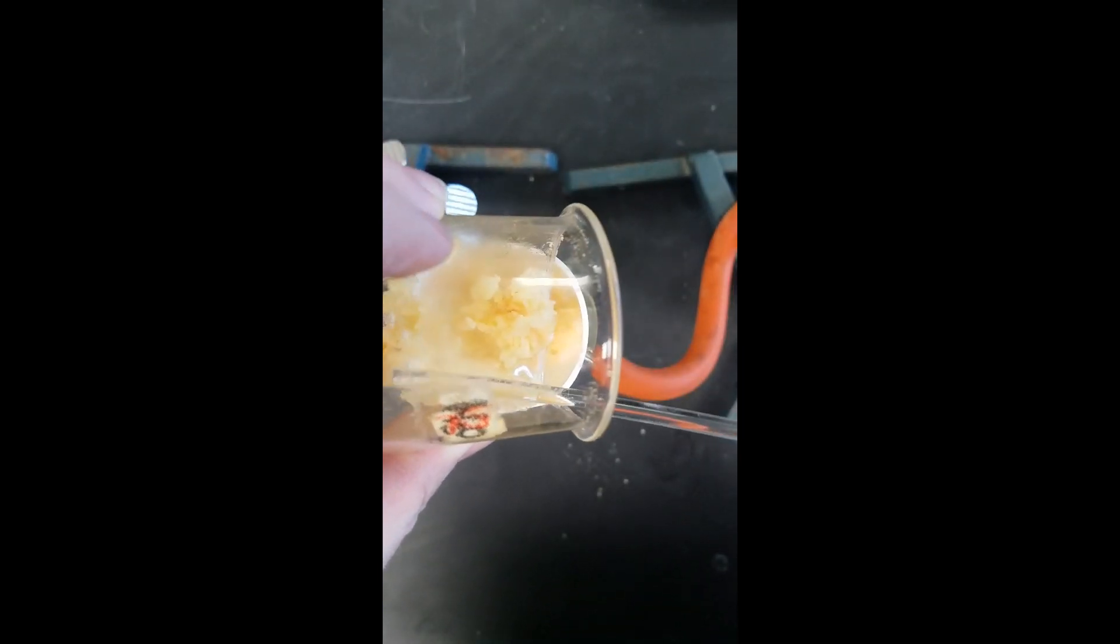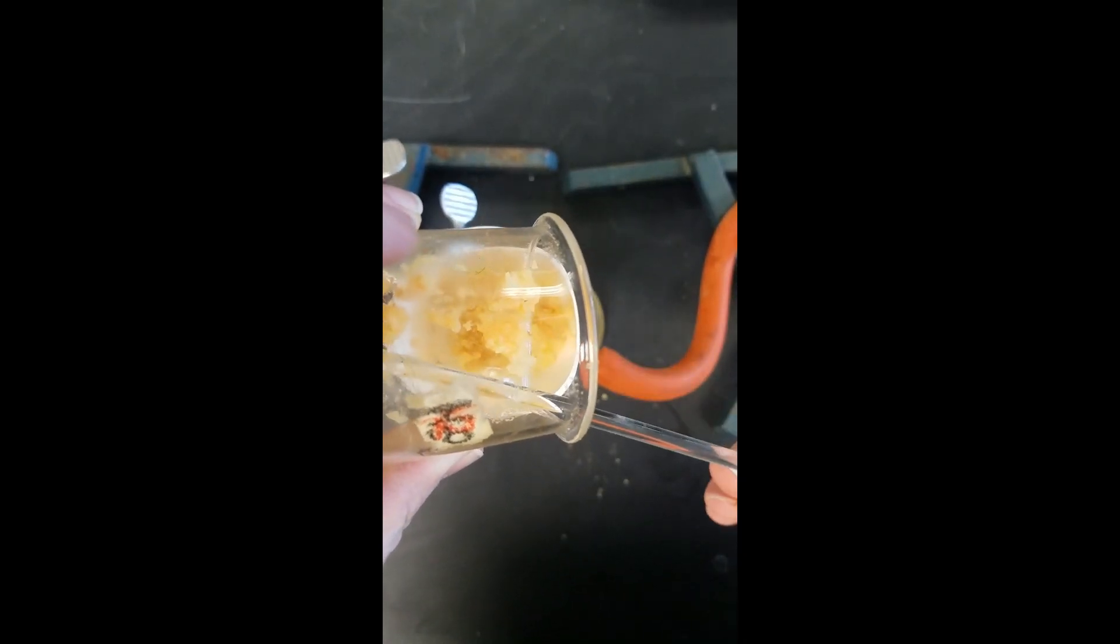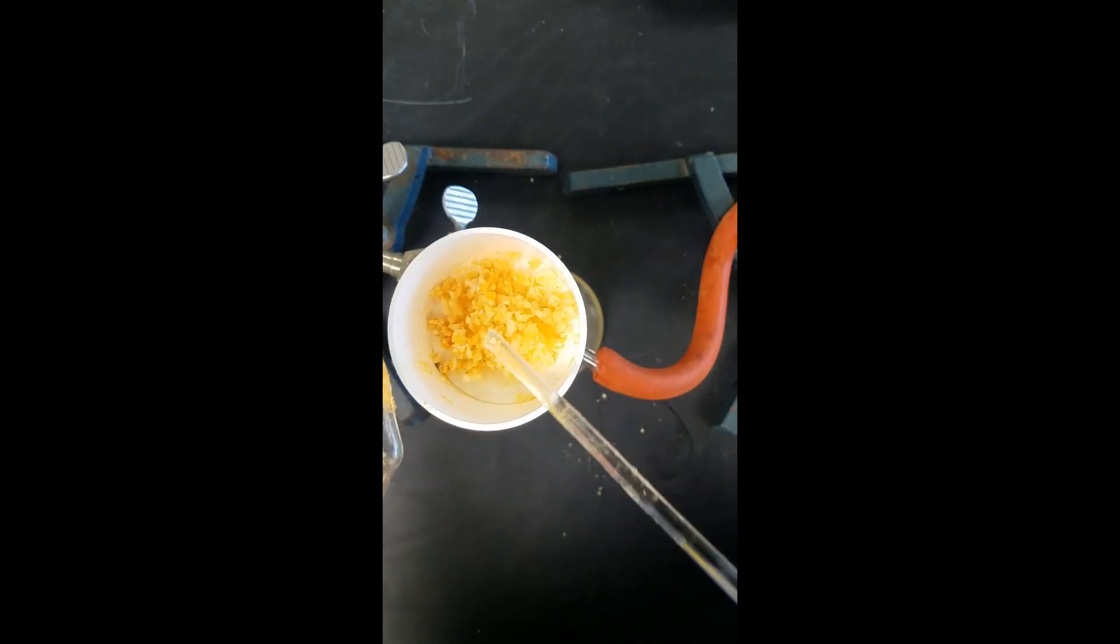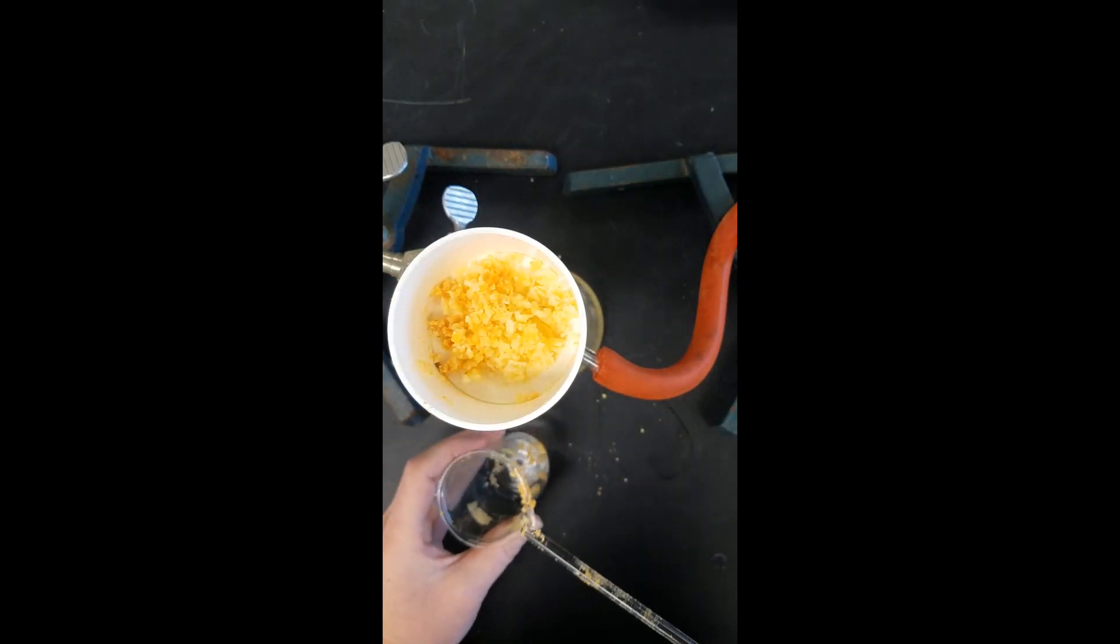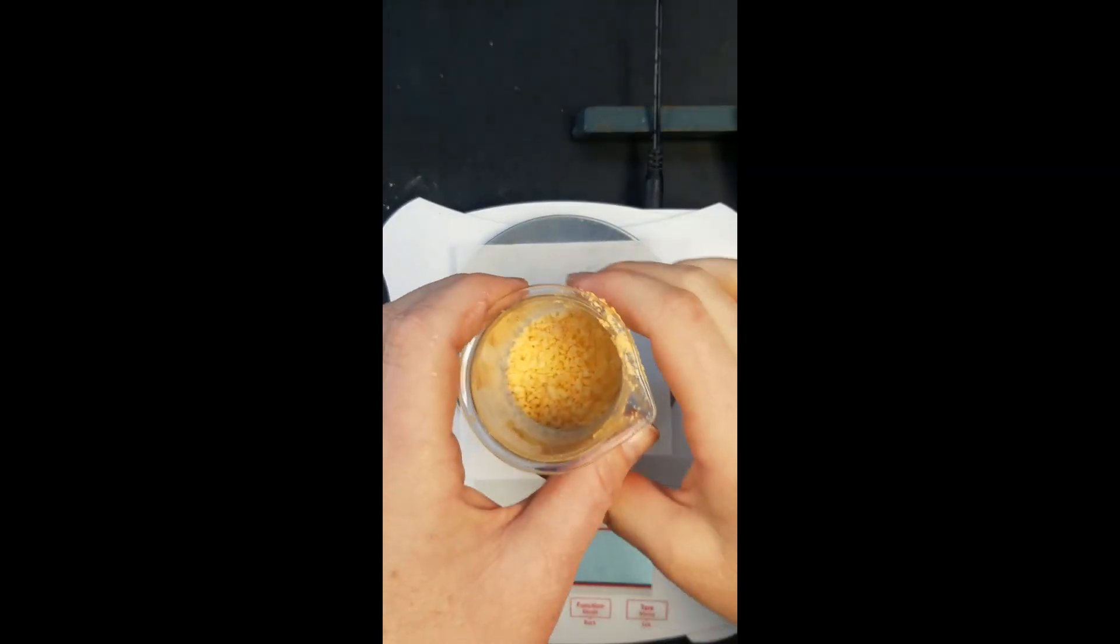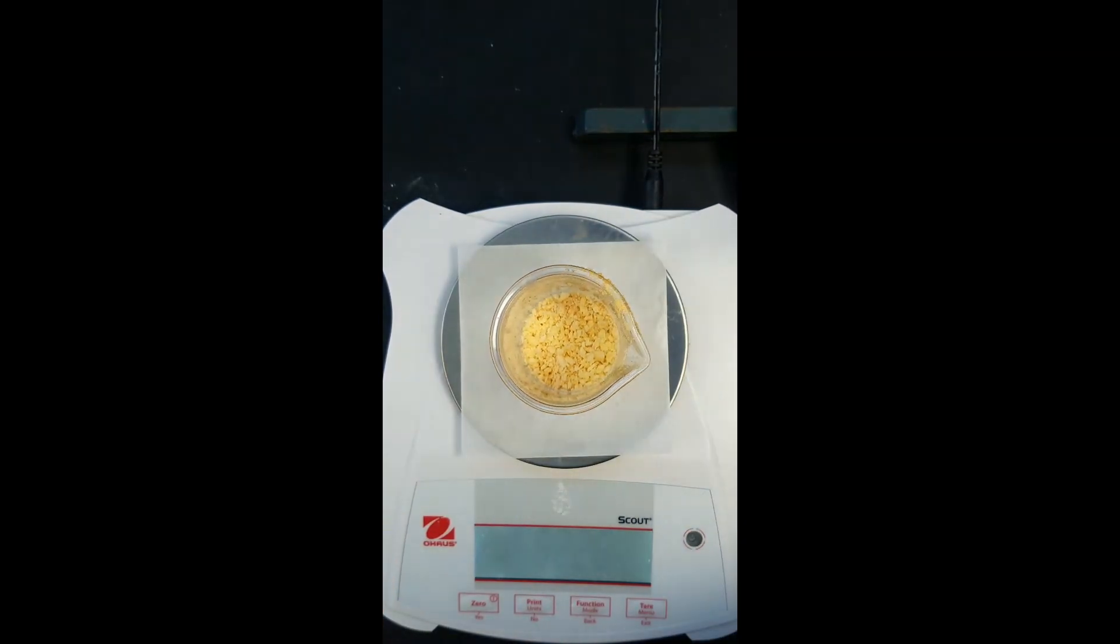Once this has been filtered, we're going to make sure that we allow the vacuum to run for a minute to make sure all the petroleum ether has been removed, and we're going to place it back into the beaker so that we can get a final weight of our potato chips. We're going to get the final mass of our Ruffles potato chips. So this is after we have extracted all of the fat.